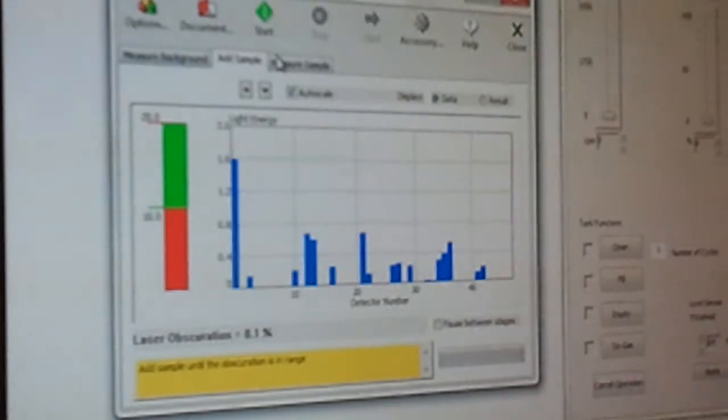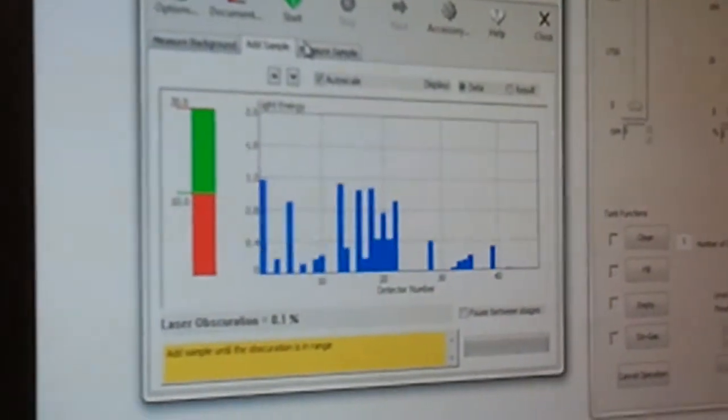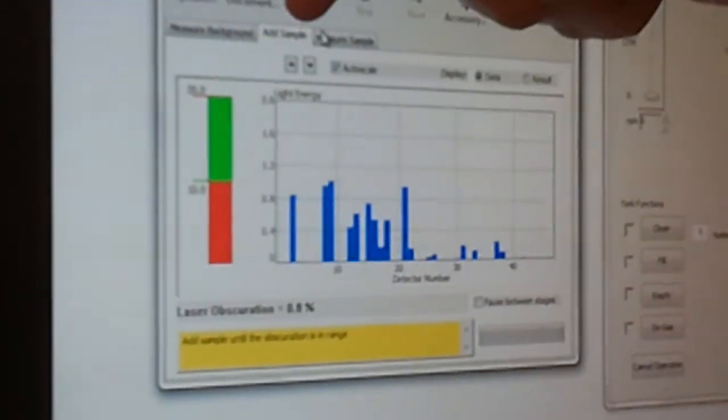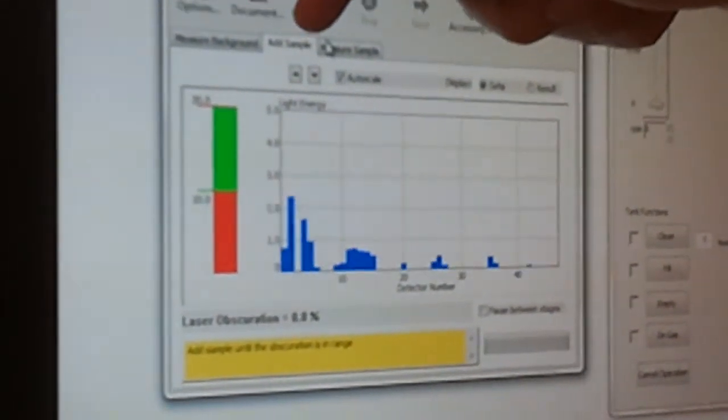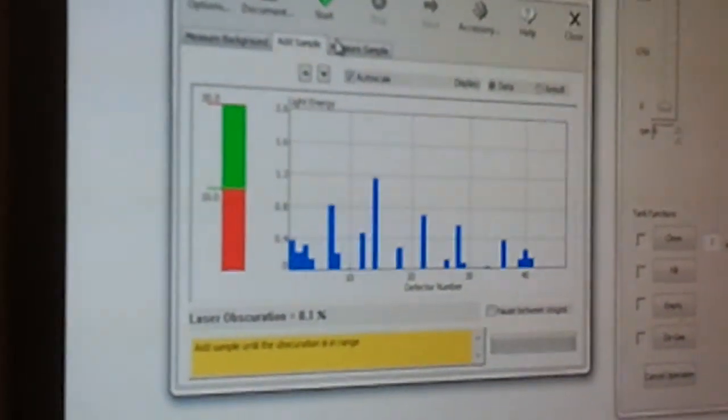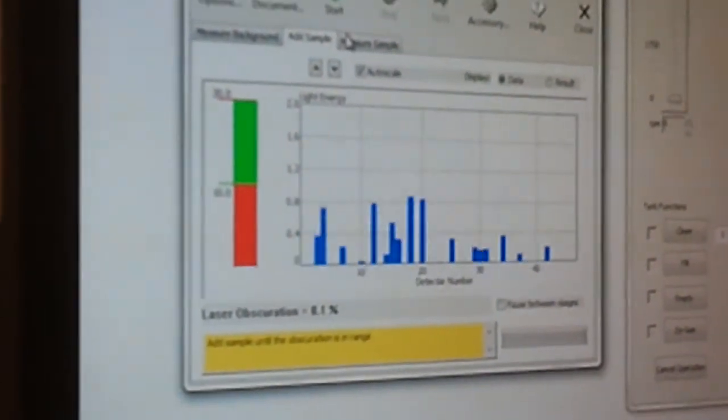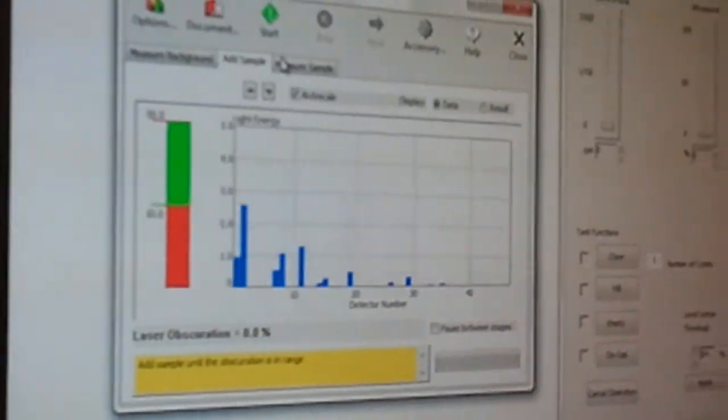Yeah, there you go, point something. Right now it's in the tab that is 'add sample.' At this point you're going to get your pipette - this should be calibrated that way - so you get your pipette and you input.